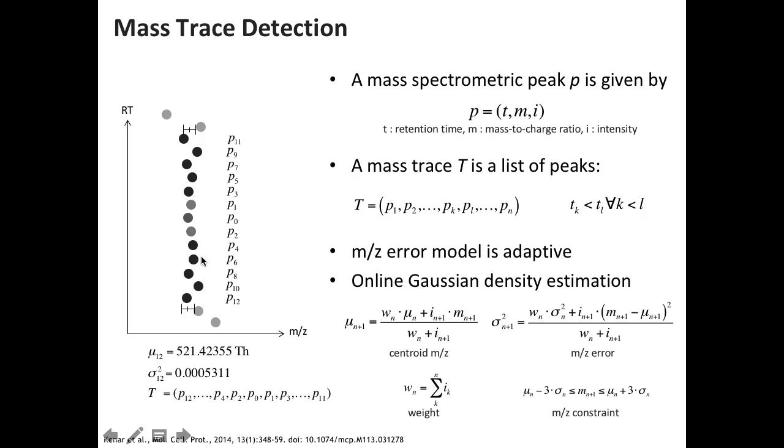So you predefine this sigma, like 2 standard deviations away from your error, as what you call it, outside of the... Maybe, aren't you losing things that are within the instrument error, but you lost them because you restricted the domain?